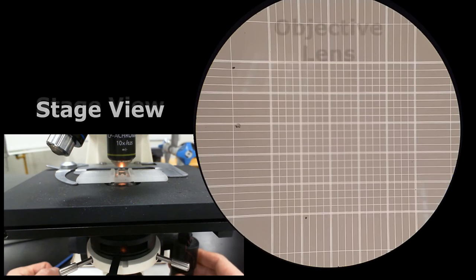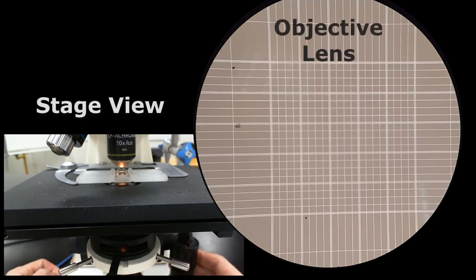Now in this case, I didn't need to do anything special with the microscope to see these lines. That's just because the surface is very highly polished, and so there's a very clear distinction between the lines. That's the nice thing about this particular counting chamber: you have a very highly polished, mirrored surface, and so you have a very obvious distinction between the lines and the background.